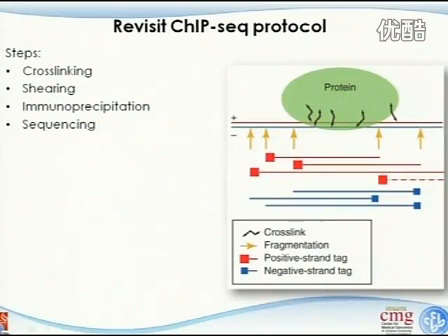So most algorithms will take different strategies, but before we go to the different strategies, let's revisit this ChIP-seq protocol a little bit further.